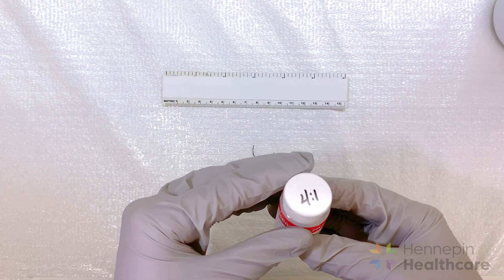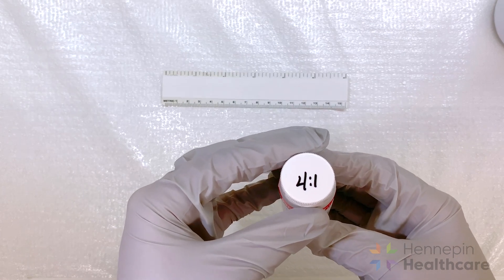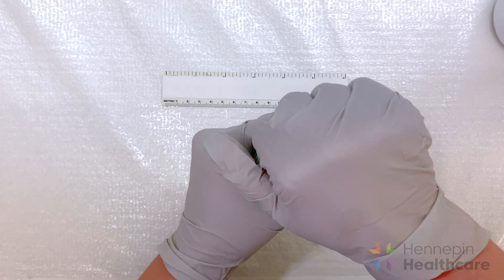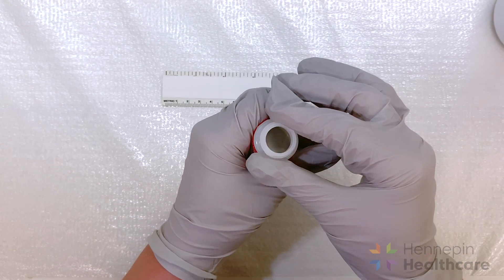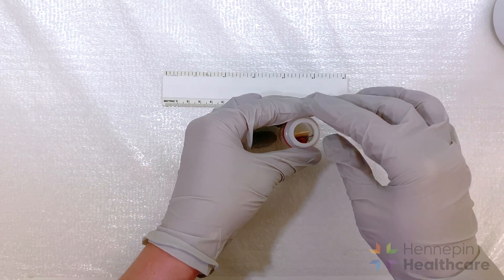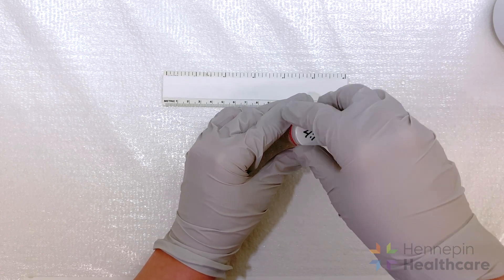Submerge the tongue blade with the tissue into a vial of 4 to 1 EM fixative and label it with the patient sticker. Our lab provides two types of fixative: 4 to 1 formaldehyde and glutaraldehyde for muscle and kidney biopsies, and 3% glutaraldehyde for nerve biopsies. Please be sure to use the 4 to 1 EM fixative for the muscle biopsy. Both types of fixative should be kept refrigerated and are good for at least one year.